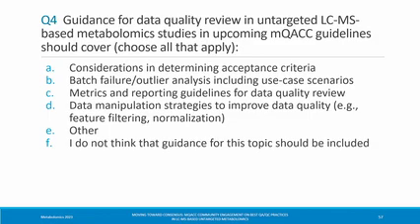Go ahead. I believe that we need an inter-batch QC sample.